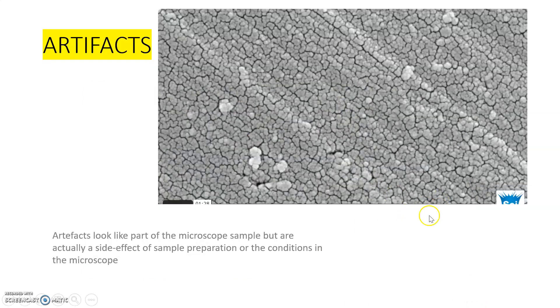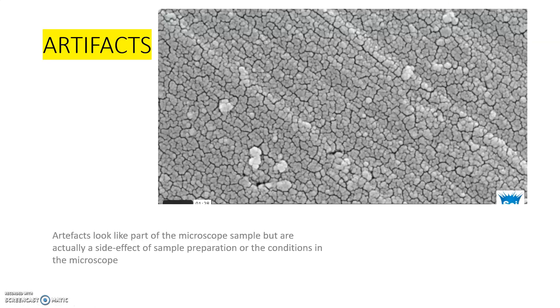These are examples of artifacts — they look like part of the microscope sample, but are actually a side effect of sample preparation or the conditions inside the microscope. The white-colored areas visible here are called artifacts. That concludes today's class. In the next session we will discuss the different methods used in sample preparation for SEM and TEM separately.